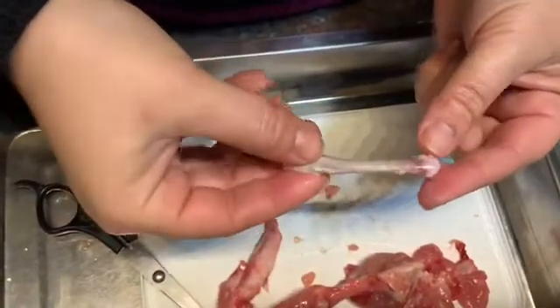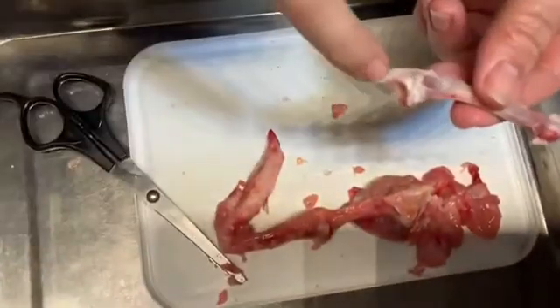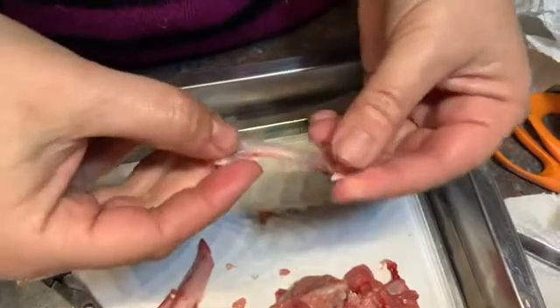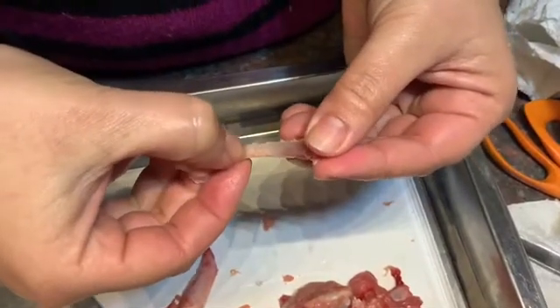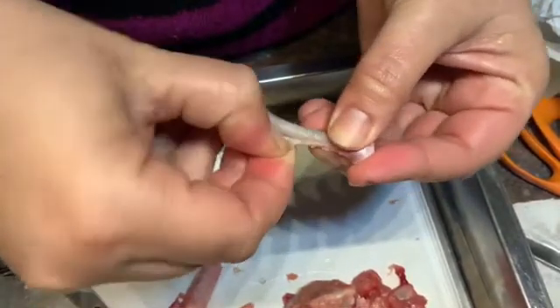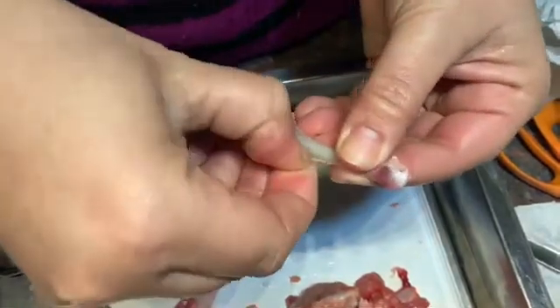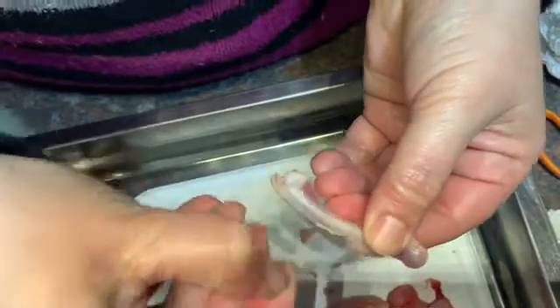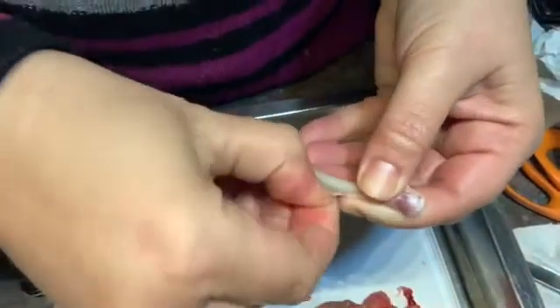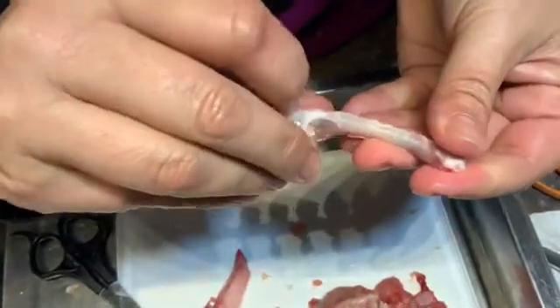I've removed the ulna from the chicken wing now. As you can see, this is a long bone. We have the two epiphyses and the long diaphysis between. By running my thumbnail along the bone, I've actually managed to pull off the periosteum on the back, which you can just see is a sort of see-through membrane. Just by scraping it off with my nail, I've been able to pull that off from underneath the other connective tissue and fat on top.